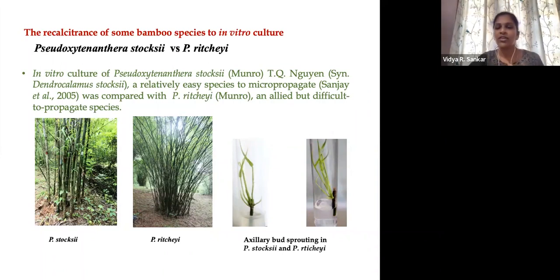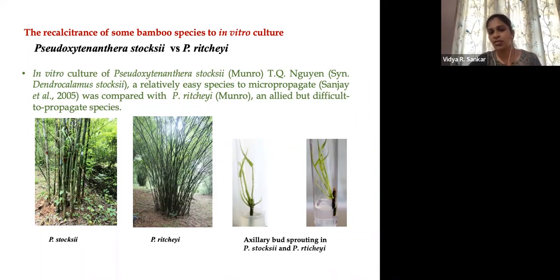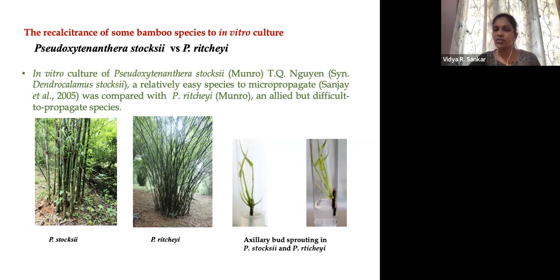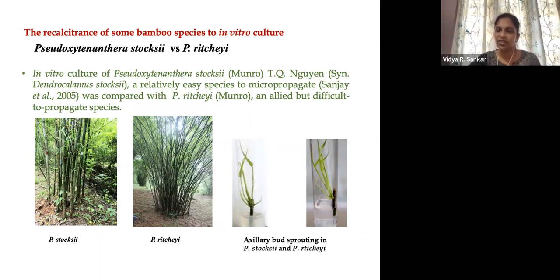We tried to establish a protocol for ritchiei but found that this is a bit recalcitrant in many aspects. The first issue is that it couldn't give a better sprouting response. When inoculating stocksii, within three to five days we will get a better sprouting response with five to six initial buds. Whereas ritchiei gives a very low sprouting rate.